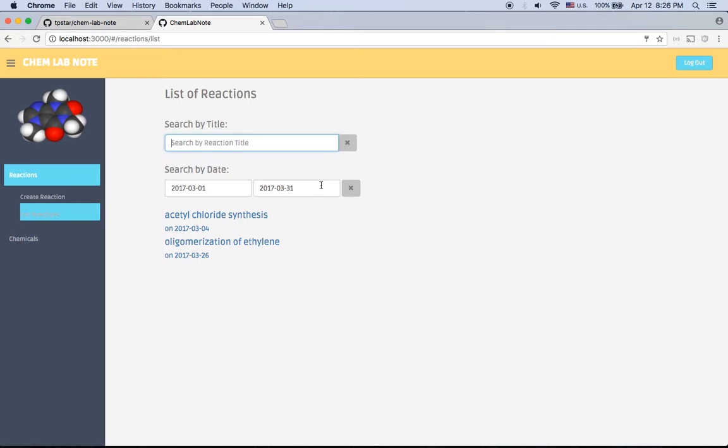So let's say you know that it was related to acetyl chloride, and then it will find that reaction for you.